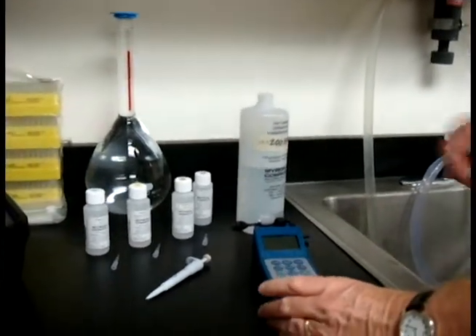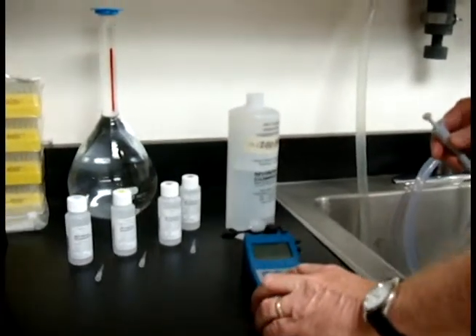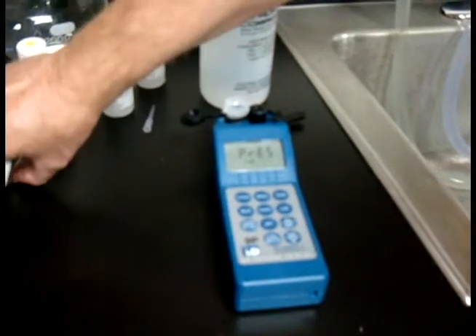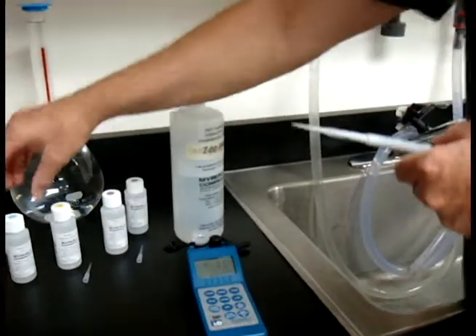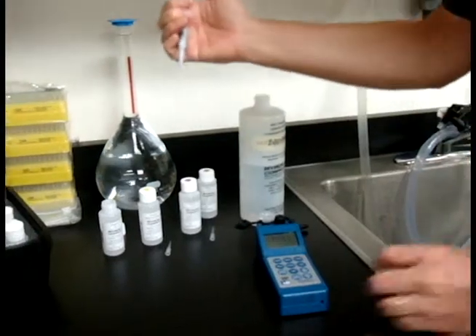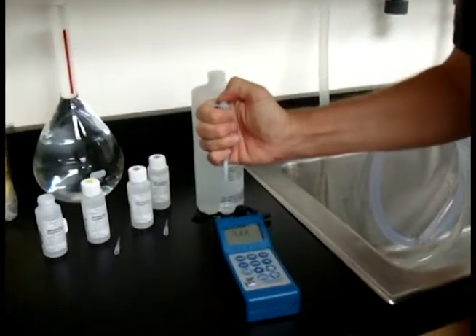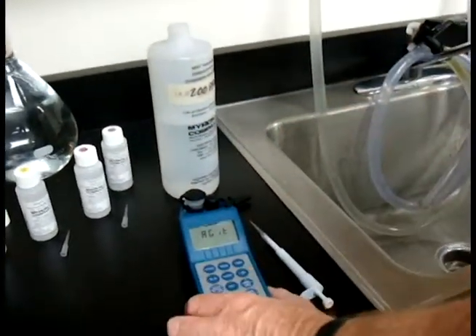Now we're going to get ready — grab your pipette and hit Hardness. It says press Cal. Before you do that, you'll need to get your tip on. For hardness, you're going to be using C1 first. Hit Cal and it's going to say add C1, so get your C1, put that in, and close the cap carefully.